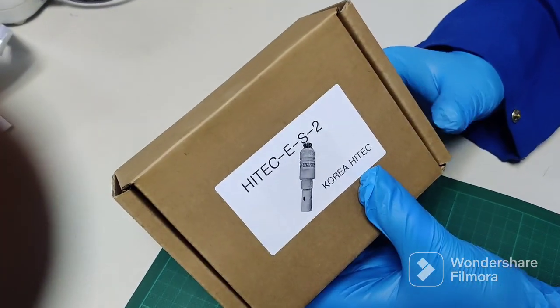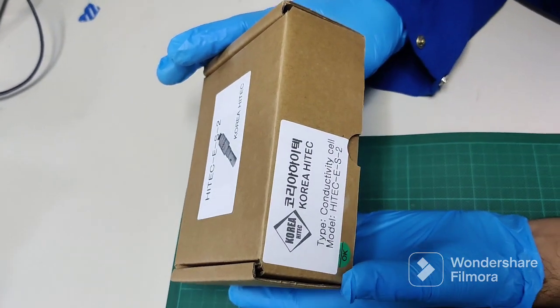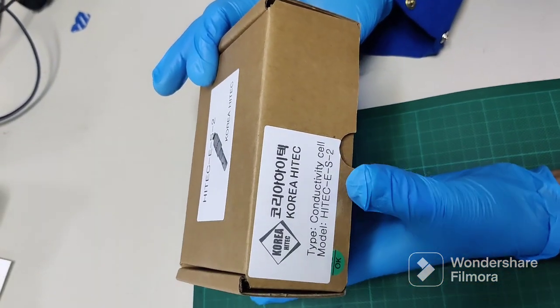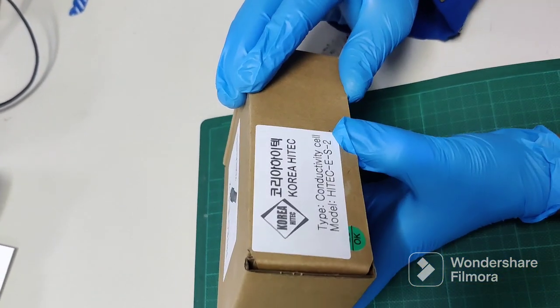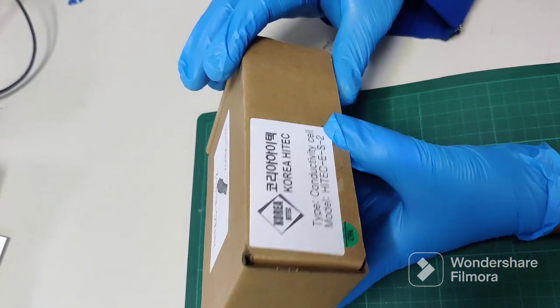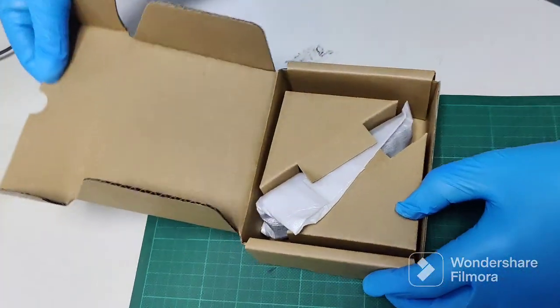This is the Korea HITEC. Now I will show you our unboxing of the Korea HITEC. This is a conductivity sensor to find the conductivity of the water. So we will put it in our unboxing.